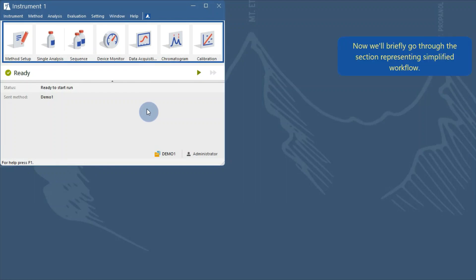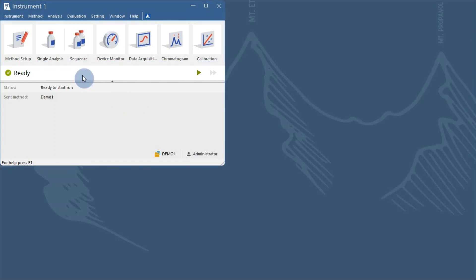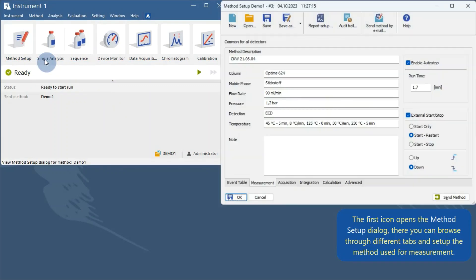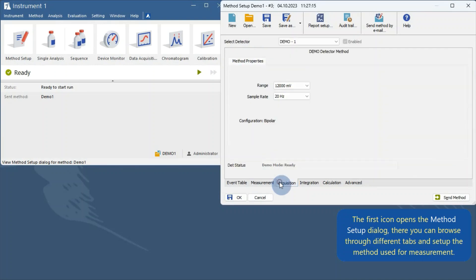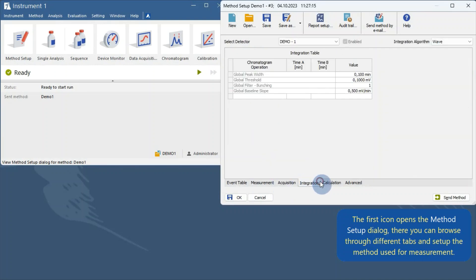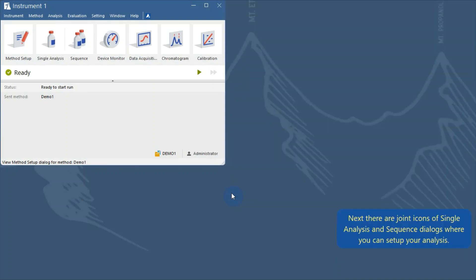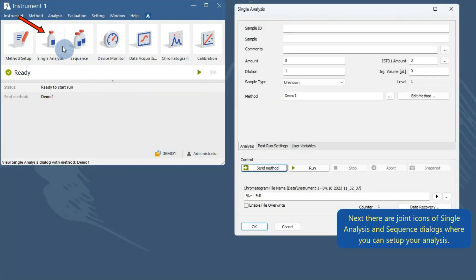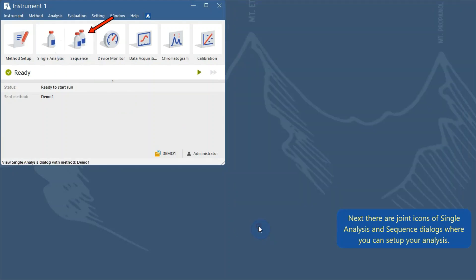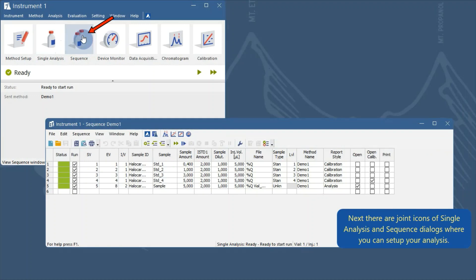Now we'll briefly go through the section representing the simplified workflow. The first icon opens the method setup dialog, where you can browse through different tabs and set up the method used for measurement. Next there are joined icons of single analysis and sequence dialogs, where you can set up your analysis.